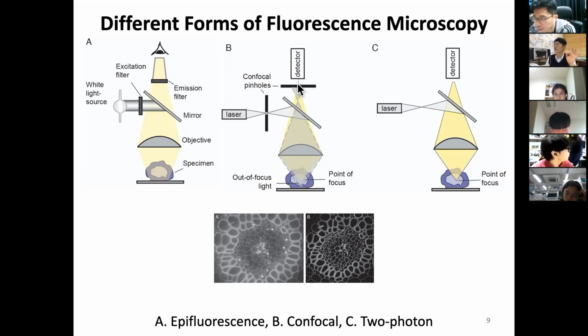So you remove the pinhole, and you always capture all the emission photons, so that you can have better emission photon collection. And then how can you make an image? You just move around these points in 2D and 3D. So this is like magic. It happened exactly 30 years ago. Now many biology laboratories and neuroscience laboratories depend on this new technology.